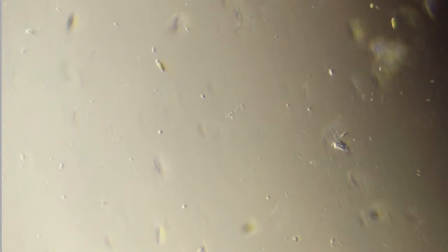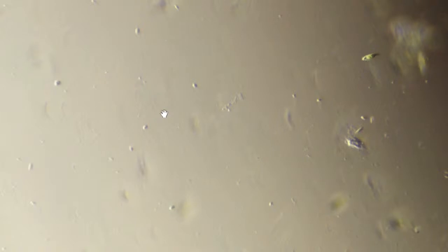Oh, nice. There's a Euplotes cruising by there, looks like, with the little spiky cilia sticking out on the top and bottom. But it's swimming a little too fast. Let's go to one of these Euglena. They're quite slow. You can see the red eye spot there. Let me do another digital zoom here to cheat a bit.